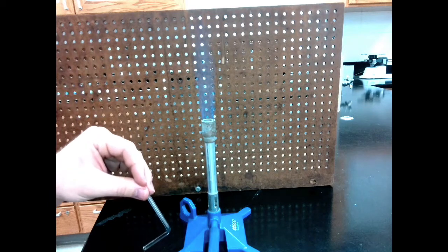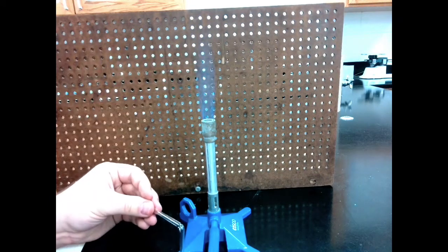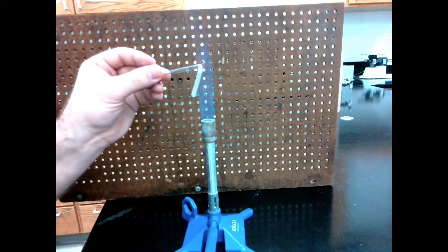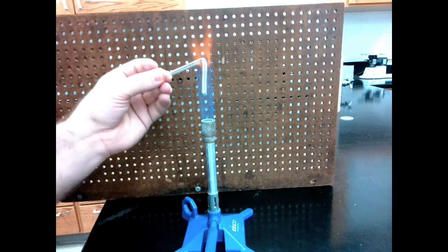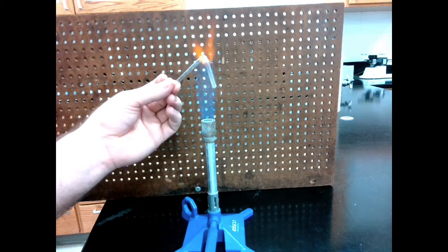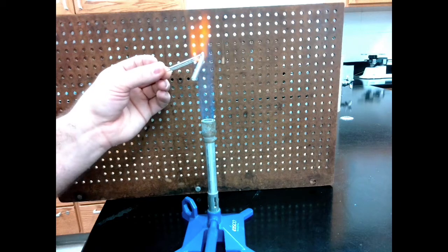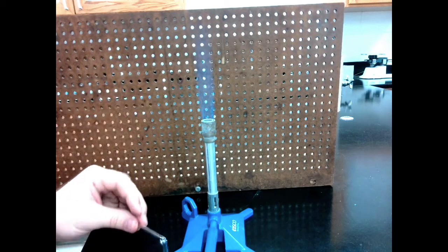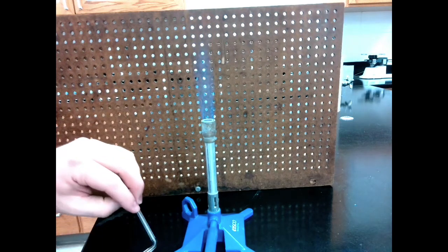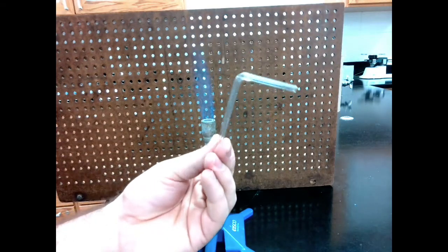If I need it a little more bent, I can push it against the table lightly. If I need it less, same thing. If I've just gone too far, I could heat it up a little bit again. It should still be nice and hot. Just get it until it's a little bit ready to move. Then I can just use my table to bend it back and forth. So, there we go. Glass tubing bent and ready to go.